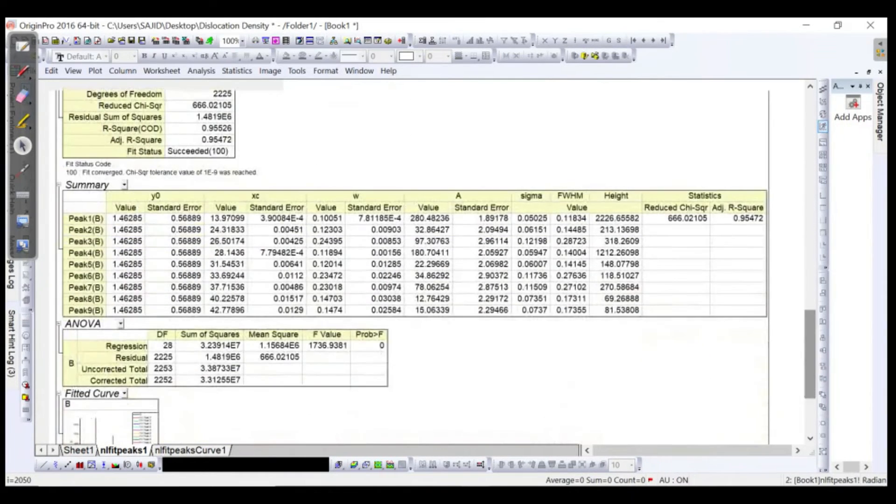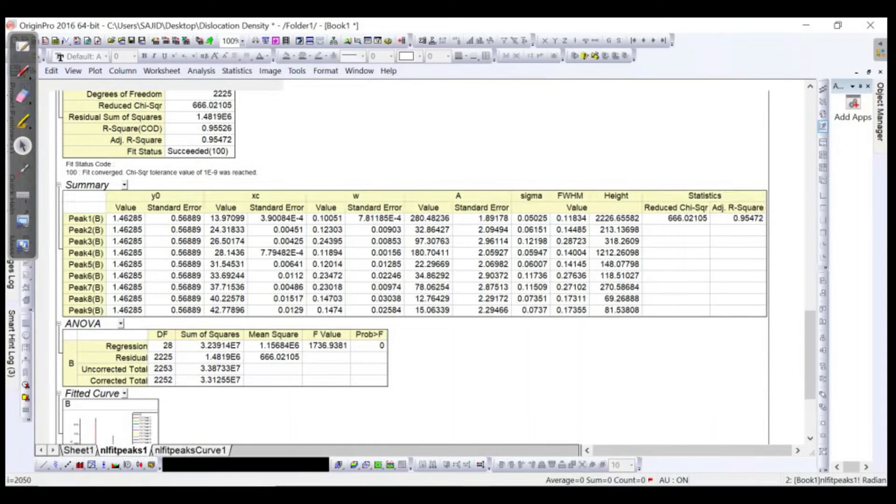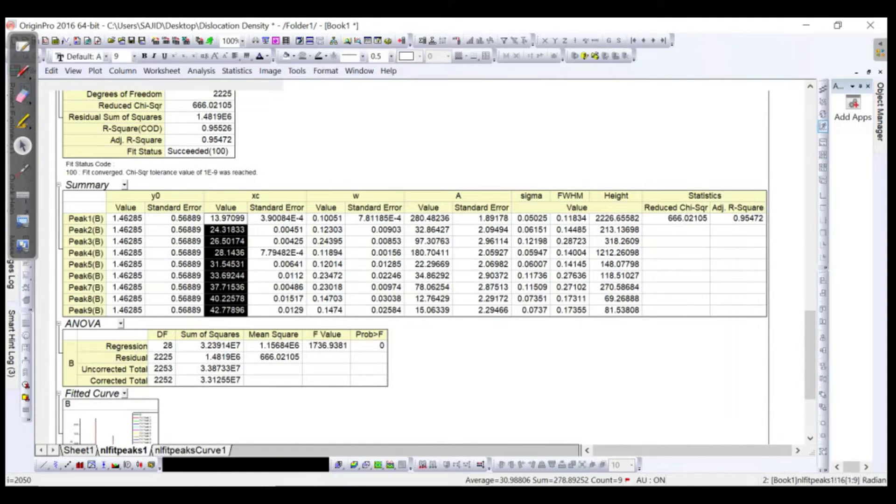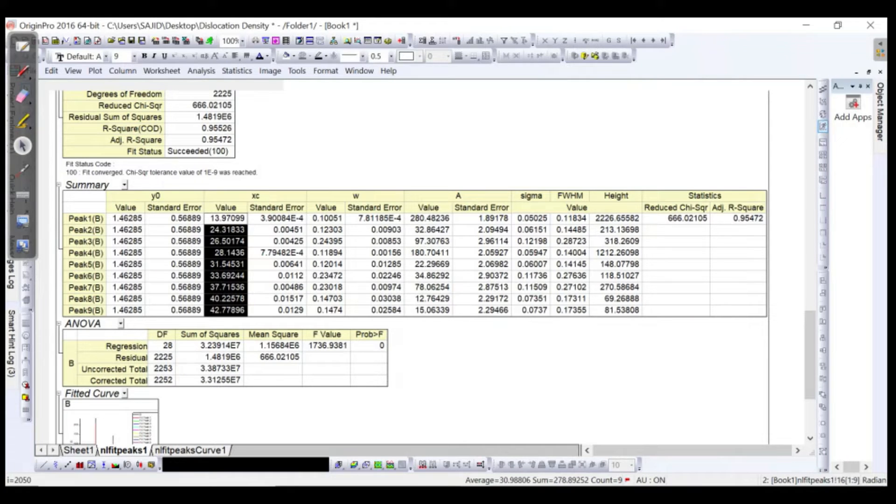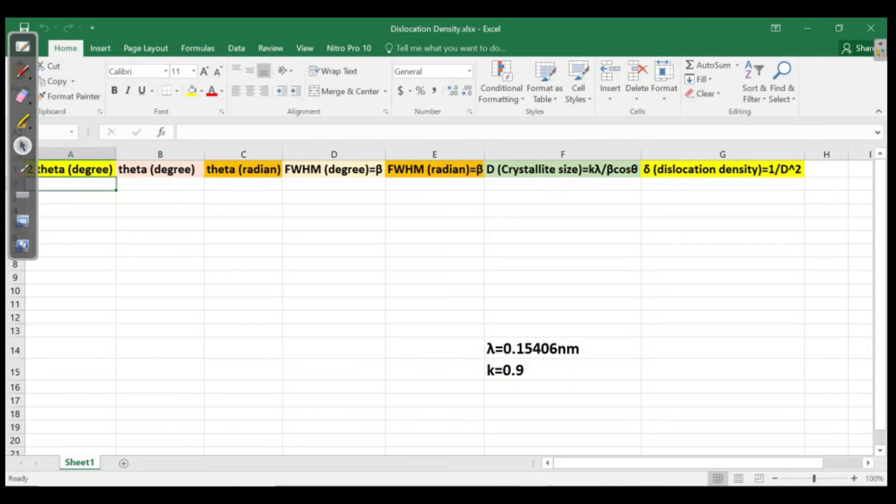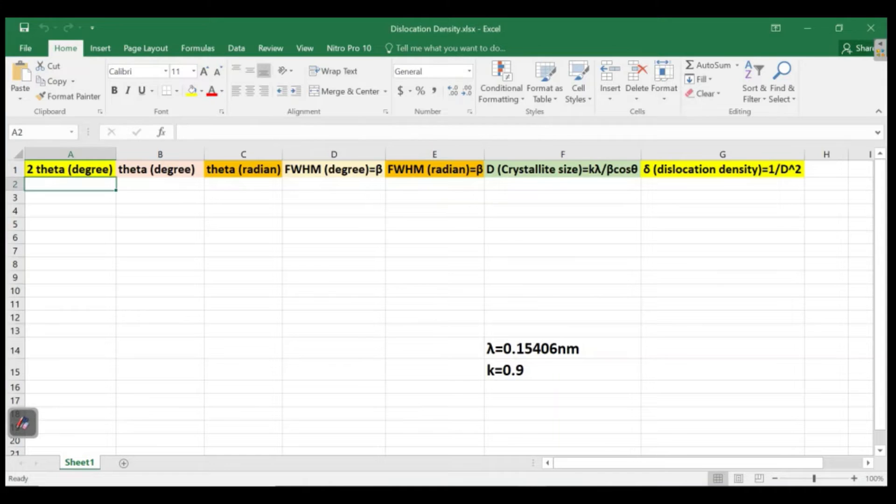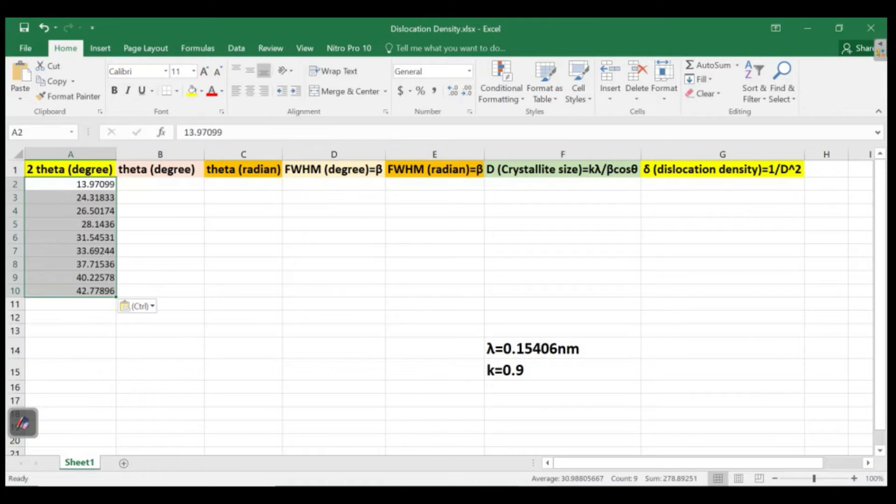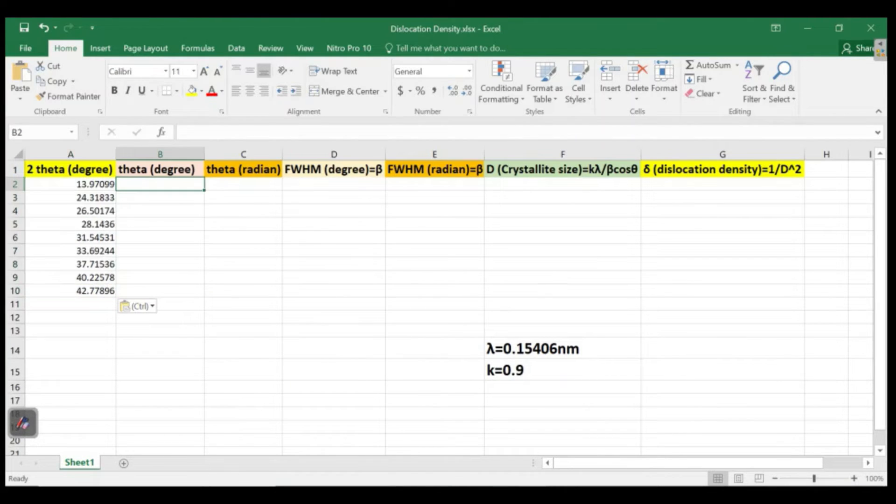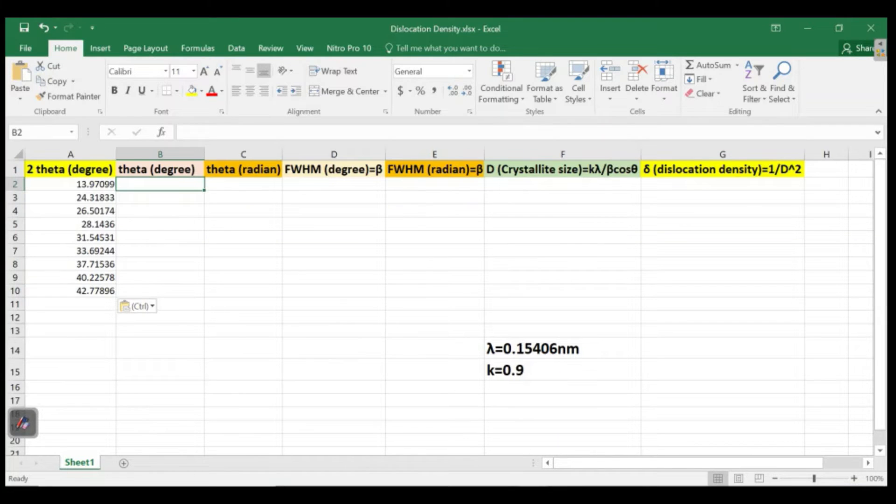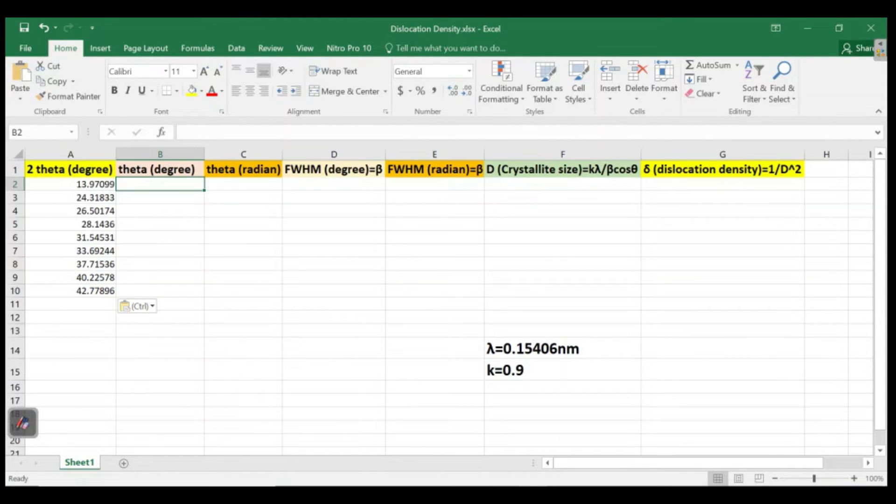Here this is actually the angle where we have the peak position. Just copy it and we have our Excel file here. We have to put this in here because this x-axis is the two theta values, so we have to paste it over here. Then we need to have the theta and we can get it from two theta. Then we have to convert the degrees into radians.